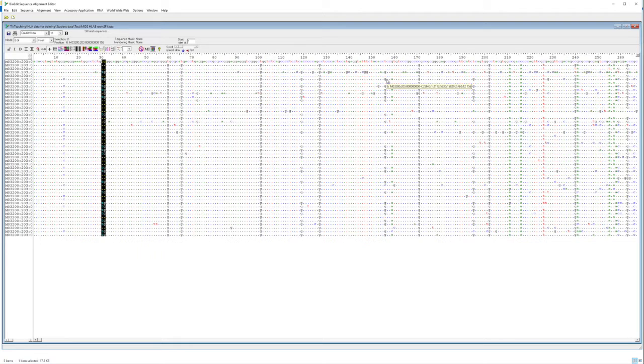And so there seems to be 2 patterns of reads here. And what these 2 patterns represent are sequences which are taken from the exon 2 of HLA-B from the 2 different chromosomes.